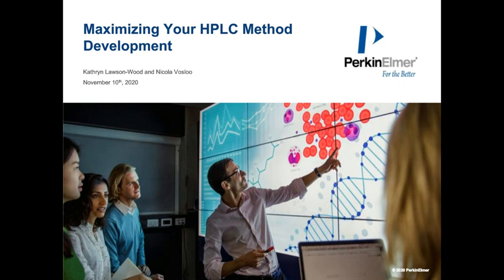In addition, we will explore superficially porous particle columns, which are currently gaining momentum in industry. But how do these differ to fully porous particle columns, and what benefits can they actually provide to your method development?